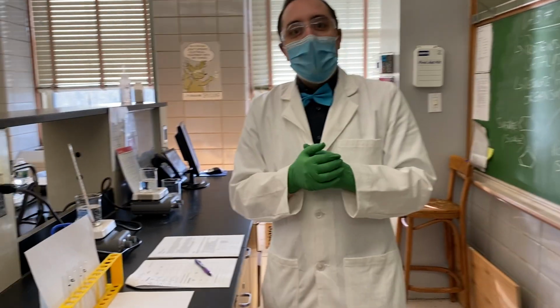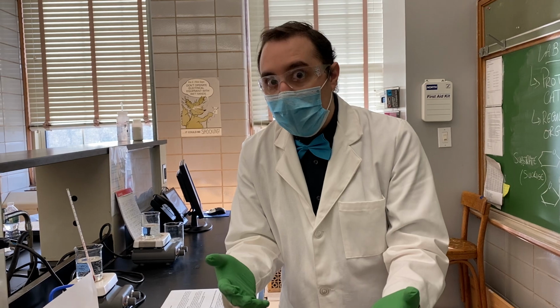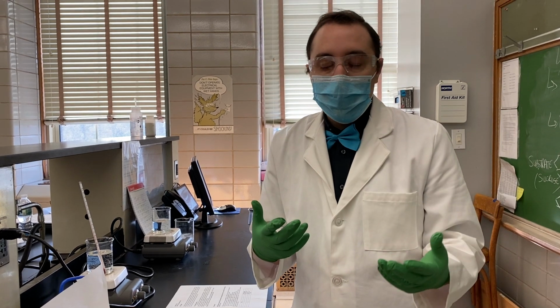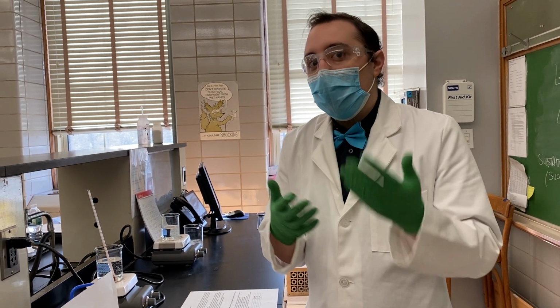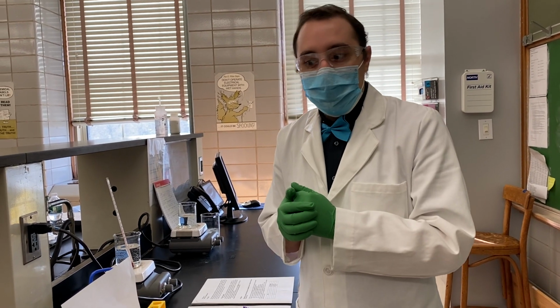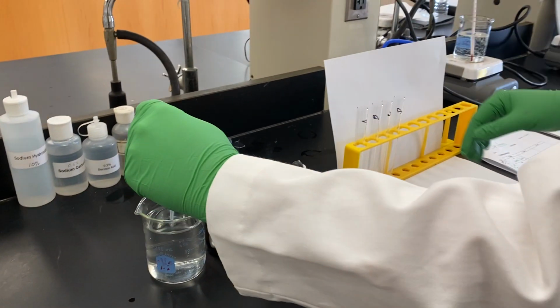Okay, we're going to test 4 different compounds if you include water as a control group. We're going to add 15 drops of 4 different compounds, including water, and we're going to see which of these molecules will be the substrate that goes in the active site for tyrosinase and causes a reaction. We're going to look at color change to indicate what this does. 15 drops we're going to add in each of the test tubes.